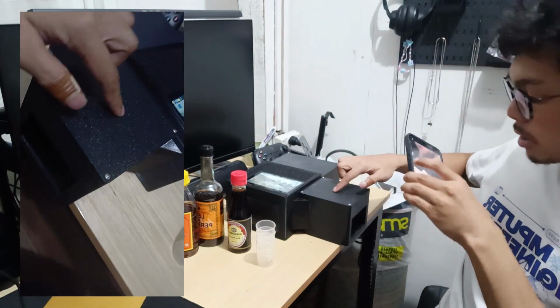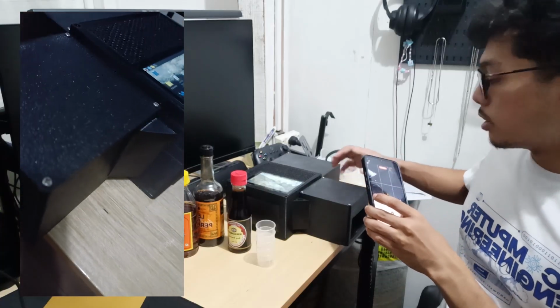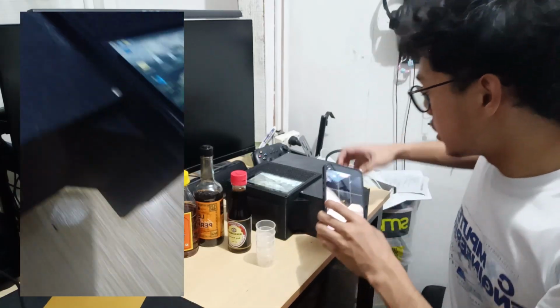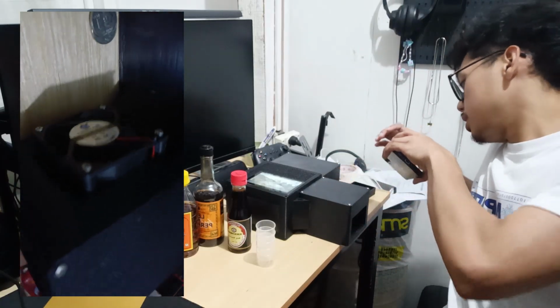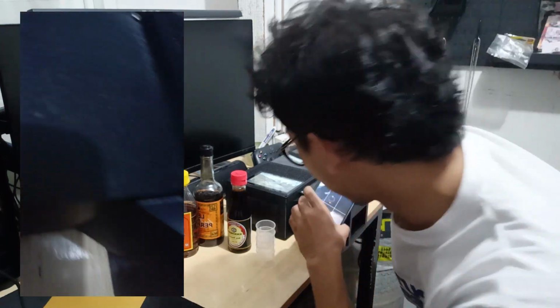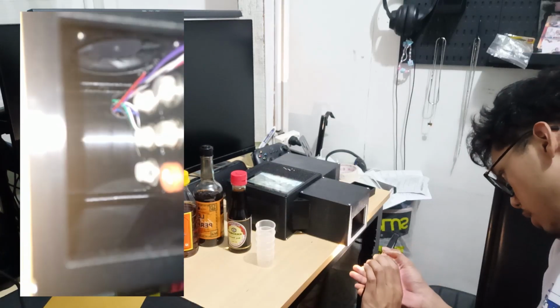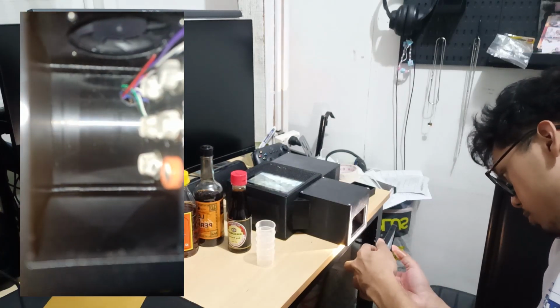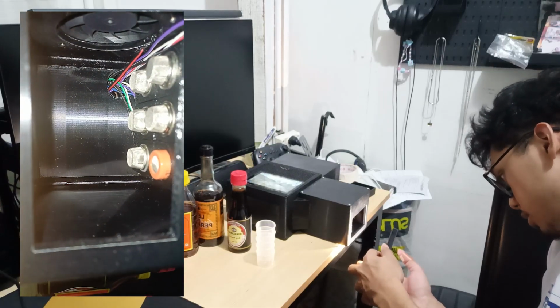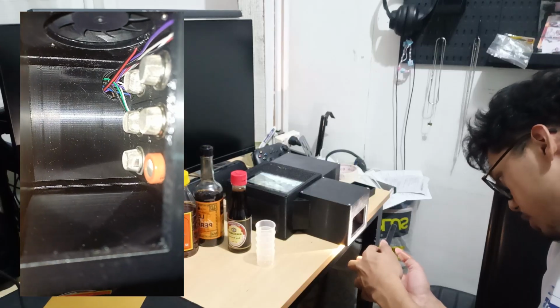Then in this compartment is the electronic nose or the gas sensor. So this is where the 6 MQ gas sensor resides, and behind is the 5 volts DC fan. So I'm going to take a closer look inside of this chamber. So as you can see, there are the MQ gas sensors. So a total of 6.